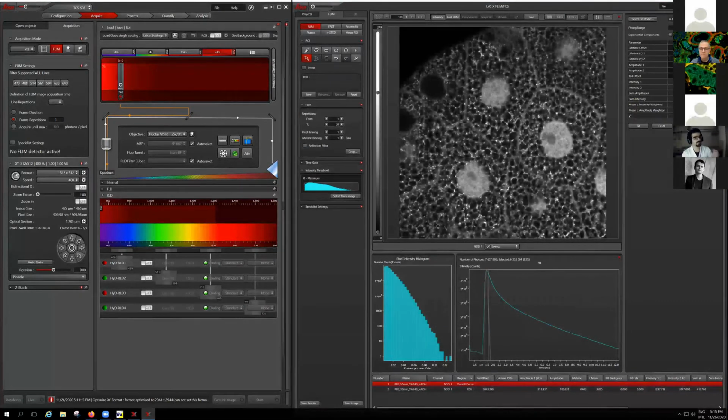So I hope that everyone can read the details. The numbers are not really necessary, so I can talk about them. If they are necessary, I will explain them. Otherwise, it's not really something very, very special there. So here, that's what I have.